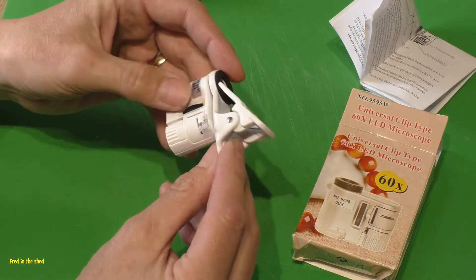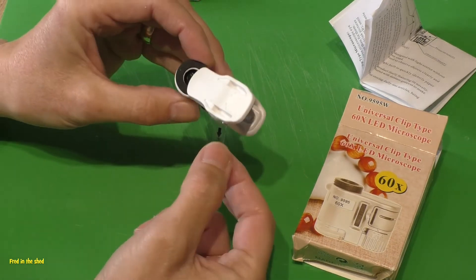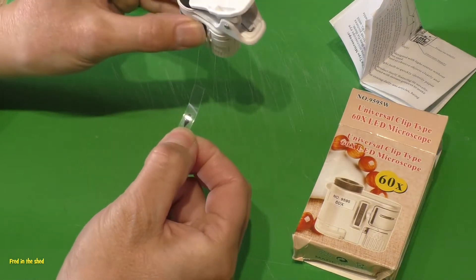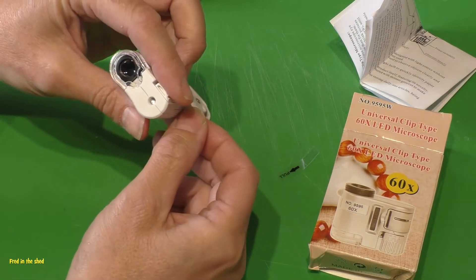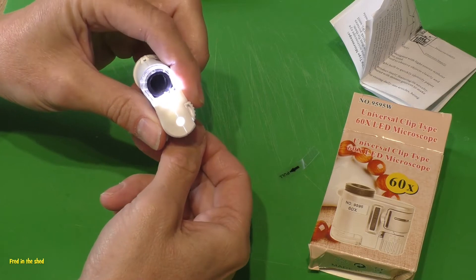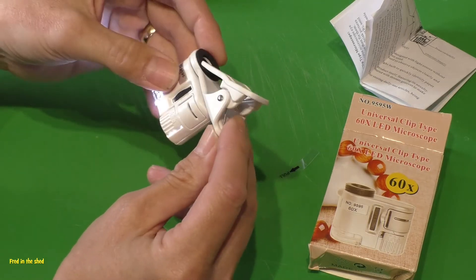Out of the box it doesn't look too bad to be honest. It's white, which will match a lot of phones. It's got these little pull tabs here, so you've got some button cell batteries in there, I imagine that's for the LED lights. Yeah, that's a little white LED that seems bright enough.